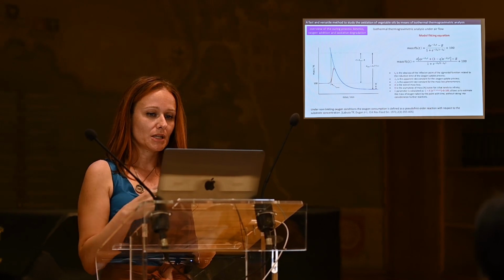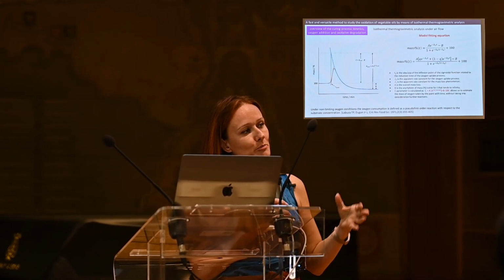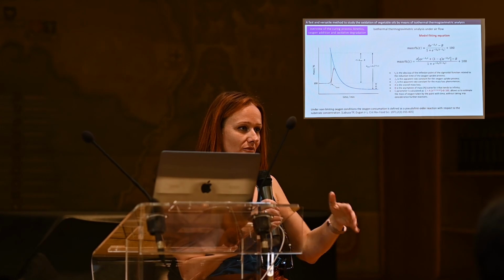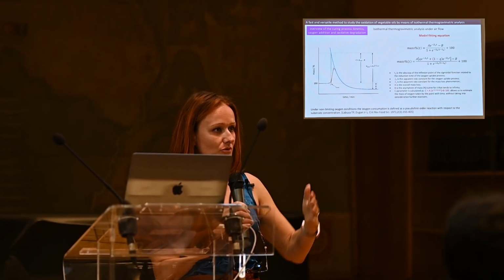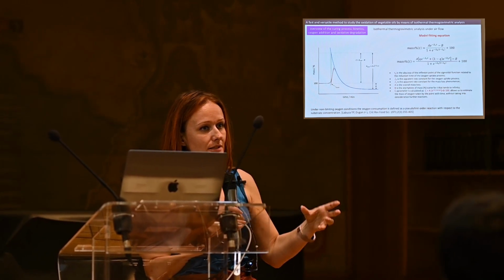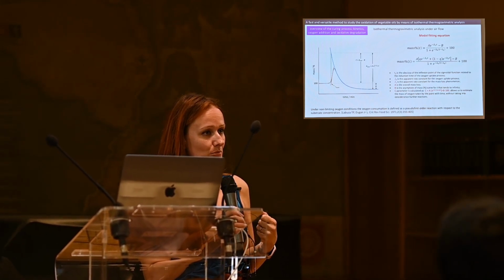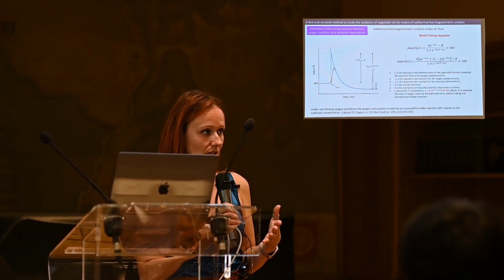So what we tried to do was to develop a model fitting equation that we could use to fit our experimental data, to give us quantitative parameters to compare different systems. With this equation, we can get kinetic parameters, but we can also estimate the amount of oxygen taken by the sample and the amount of mass that is lost because of oxidative degradation.